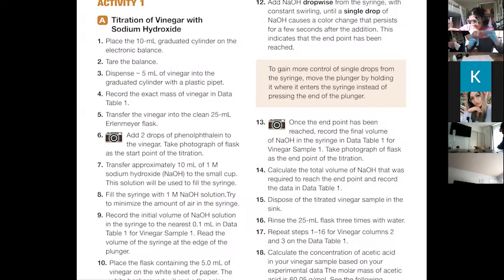All right, so what we want to do is put about 1/2 ml at a time in there and swirl. So what's important, everyone, notice that it turns pink pretty rapidly, right? And then when you swirl it, it's gone. It's a very vivid pink color. Swirl it, swirl it, swirl it, and it goes. Gone. Well, there's a tiny bit in it.